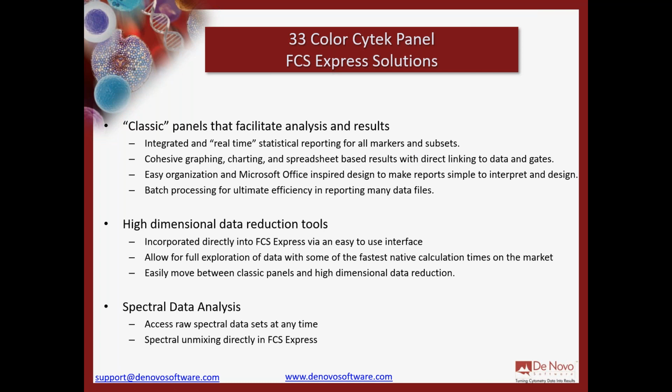So what we're going to cover today in FCS Express is essentially what I call classic. It seems like it's old-fashioned at this point with all these algorithms that are out there to perform analysis, but it's still very powerful for working with large data sets like this. So we're going to look at some of the integrated and real-time statistics, the cohesive graphing and charting and spreadsheets in the software, and how we can utilize batch processing for really great efficiency for reporting information from many data files and parameters. And then we'll take that a little bit beyond too.